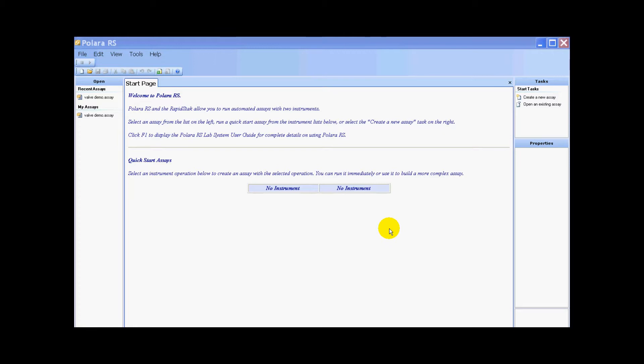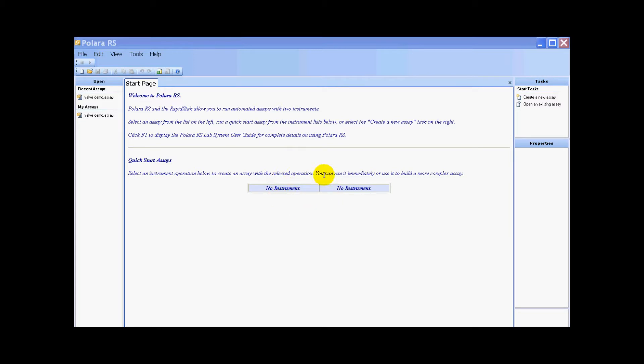As you can see, we have Polara RS open on the screen but we have no instruments. Just as when setting up with the rapid stack, we need to configure our system and add the multi-drop combi driver.